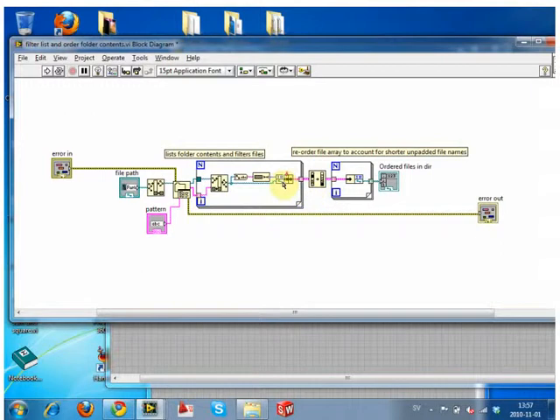And essentially by doing that, we're bypassing Windows' numbering scheme. We're allowing them to put them in order based on file name first, and that's the crucial part. So this orders them like that, and then we take that list of ordered files, and then we separate them back out, because we don't need these arbitrary tags of file length. We put them on there so we could order them correctly. Okay, because we put them on there, we have to take them back off.